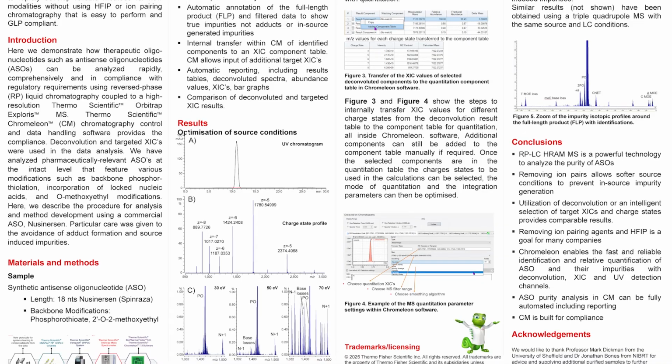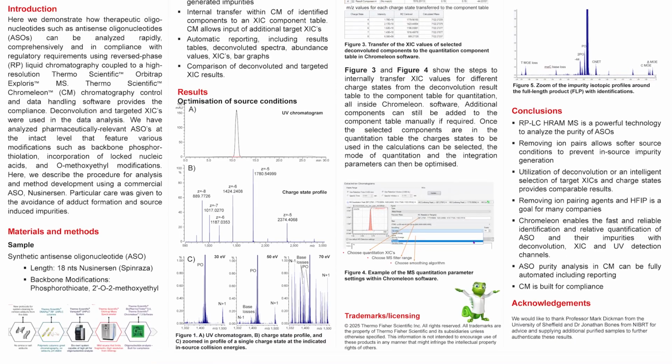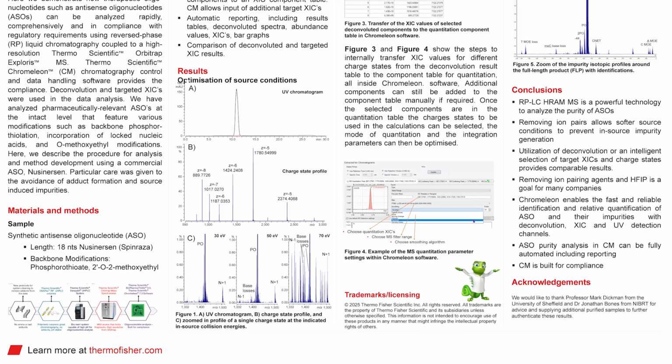Here we're using reverse phase. We're not compromising on the analytics. The sensitivity's high, the sensitivity's lower if you use HILIC. We've got rid of all the ion pairs, and it makes things a lot easier to use.